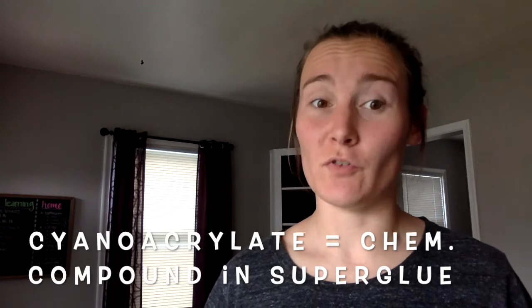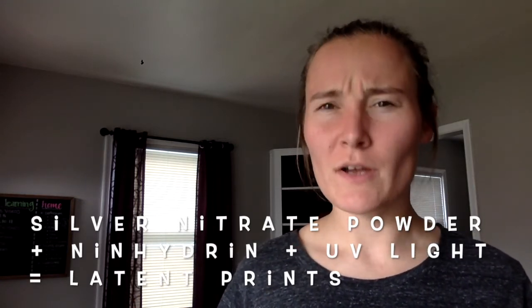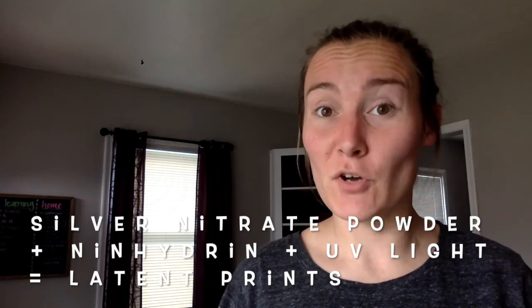So, certain chemical fumes are reacting with the sweat and the other organic residue that are left in the latent fingerprints. Now, those strong fumes are from a compound called cyanoacrylate, which is found in superglue. That chemical reaction causes the residue to turn white so that you can actually see it. We used a pretty simple technique with substances that you could probably find around your house, but professionals sometimes will also use a compound called ninhydrin, which does also react with amino acids in organic residue, and silver nitrate powder. And when both of those together react and are put under UV light, they're able to also see those latent fingerprints.